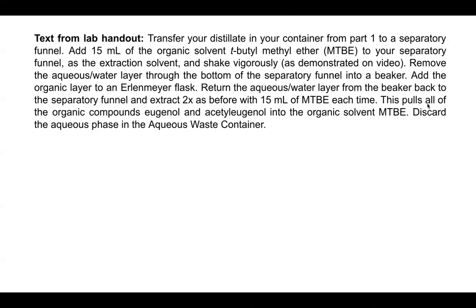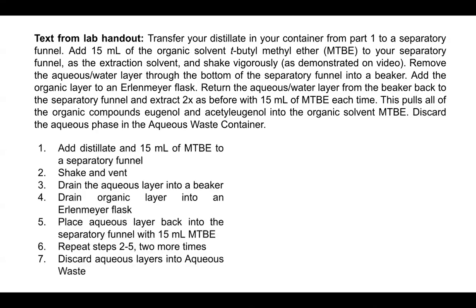This sentence right here jumps out. So the sentence, this pulls all of the organic compounds, that's a sentence that is explaining the process, but that's not procedural, okay? There's another one, a couple sentences in here, phrases that do the same thing. That is unnecessary. You need to know that's what's going on, but that's part of the science. That's not the procedure. So when I read this paragraph, I condensed it into this following procedure, where I had steps 1 through 7, okay?